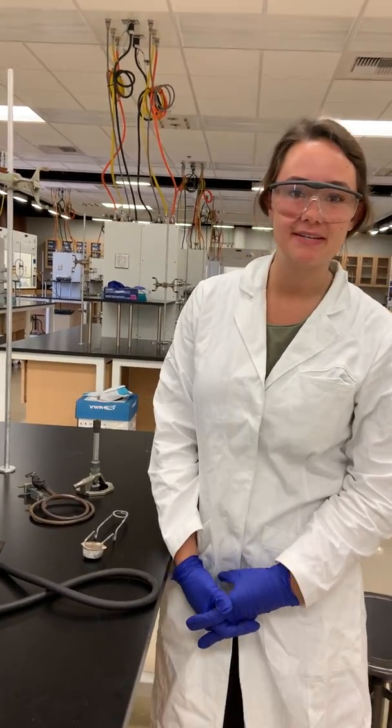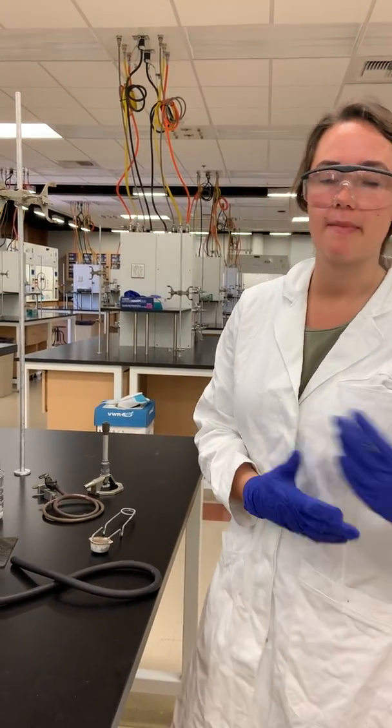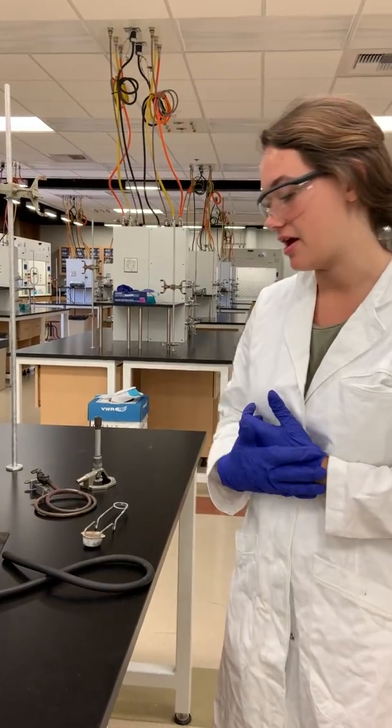Hi, my name is Hannah Coppin-Soderstrom and my TAs are JDs and JJ. Before doing this lab, I made sure to clear the area of all paper and flammable materials and I put my hair back so that it wouldn't have a chance of catching on fire.